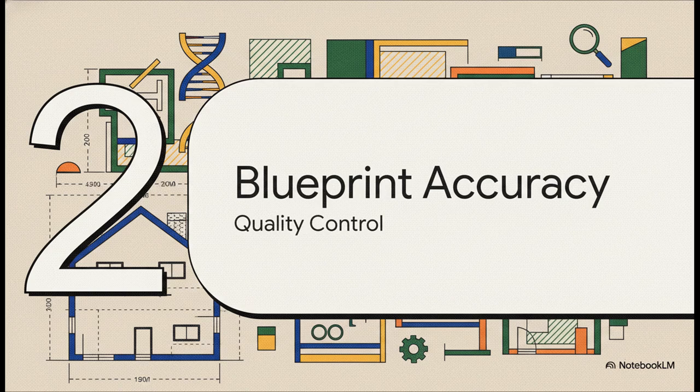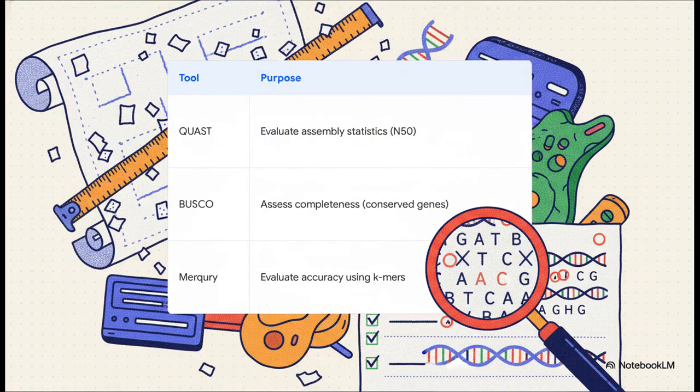So let's really dig into that first absolutely critical step, because think about it. You would never, ever build a skyscraper from a flawed blueprint, right? Well, you can't build groundbreaking science on a flawed genome. This quality control part, this is where every single big discovery really begins. So, how do scientists actually check the blueprint's quality? Well, they have this amazing digital toolkit.